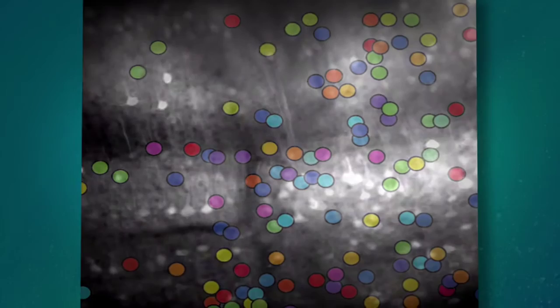We also demonstrated that not only did the microprism facilitate the imaging of deep cell bodies in cortex, but it also allowed us to image the activity of long-range axonal boutons in deeper layers of cortex. And these are boutons coming from neurons in very distant regions of cortex.